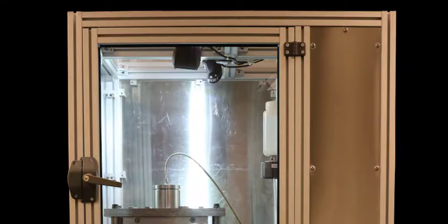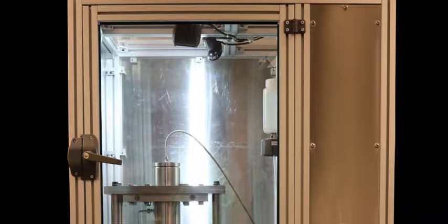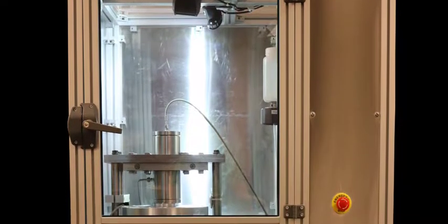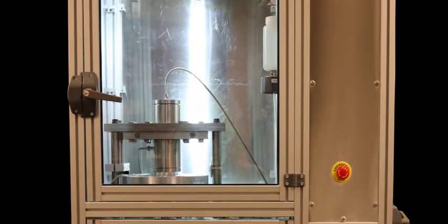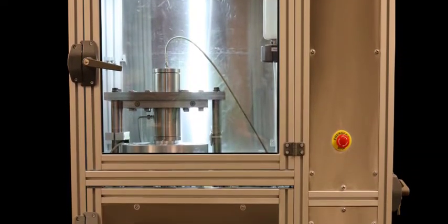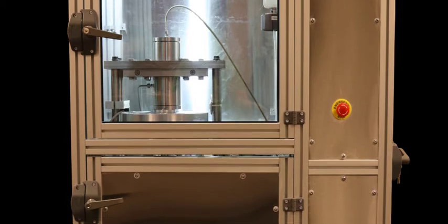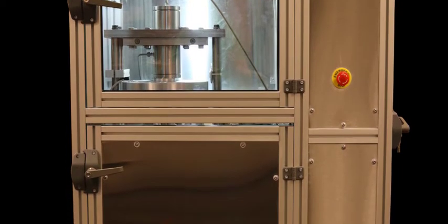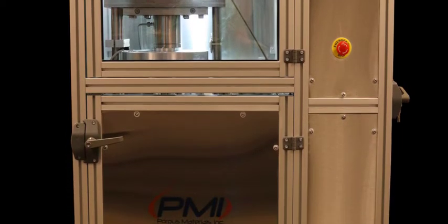Porous Materials Inc. is proud to introduce the Automated Multi-Sample Permimeter-Porosimeter APDP-HP101.